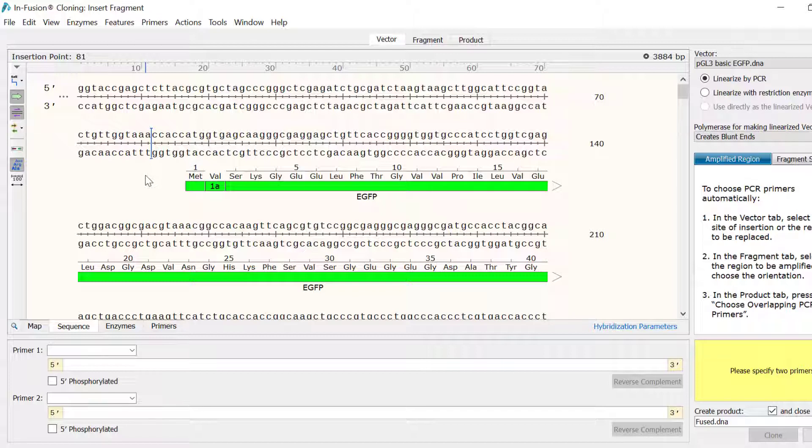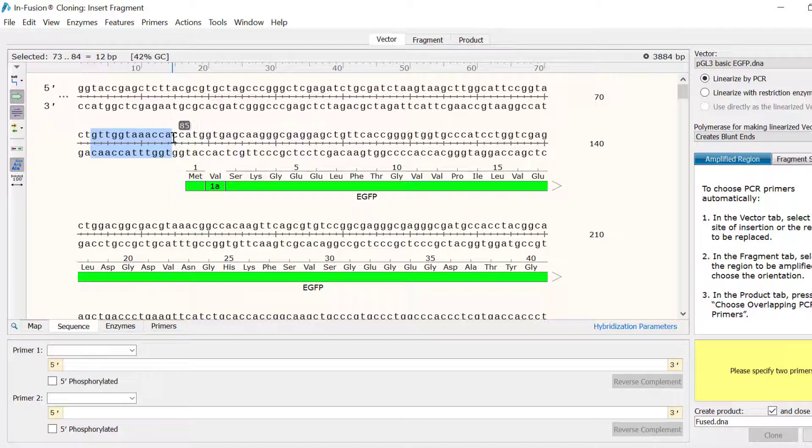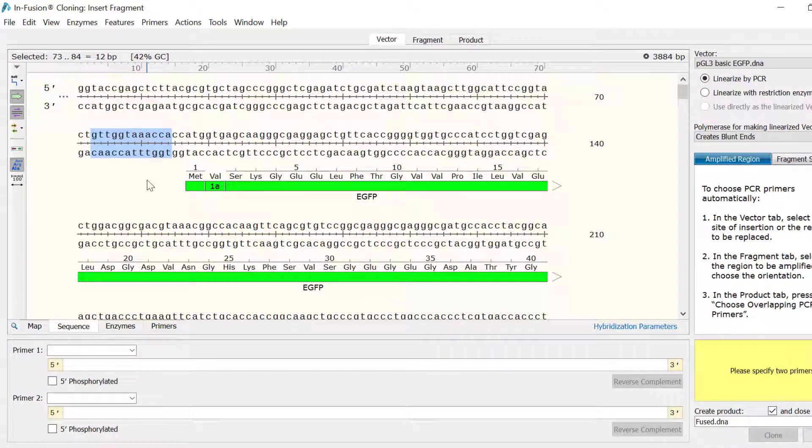Alternatively, you can click and drag on a region to replace that selected region with the fragment.